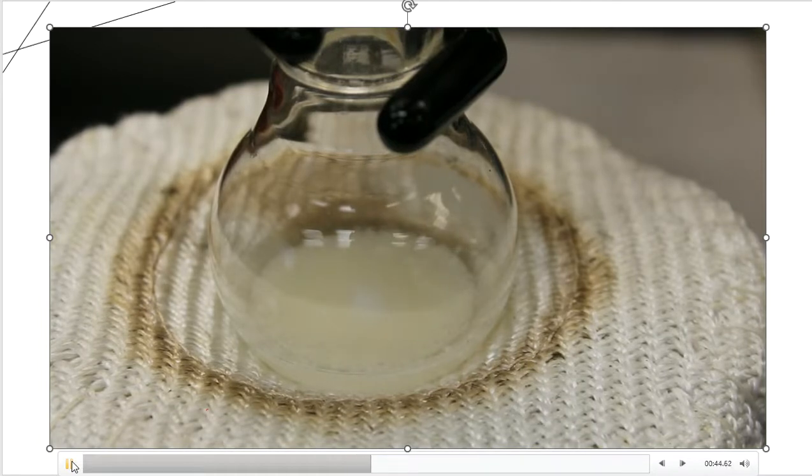You're seeing how slow this is going to go. And at this point right now, no really observational changes are happening. So it's just, once again, getting in the jacuzzi tub, getting to know each other, and this process is going to take a little bit. So aluminum chloride is inside of the flask. Acetic anhydride, which is a reagent, is now getting added to the flask. And anisole, which was already in the flask, is present, and it's meeting the acetic anhydride, and hopefully the aluminum chloride is going to introduce it to the acetic anhydride up above, and they will madly fall in love and give us product babies. So that's what we're after. So we'll see what this stuff is going to do here in a little bit.